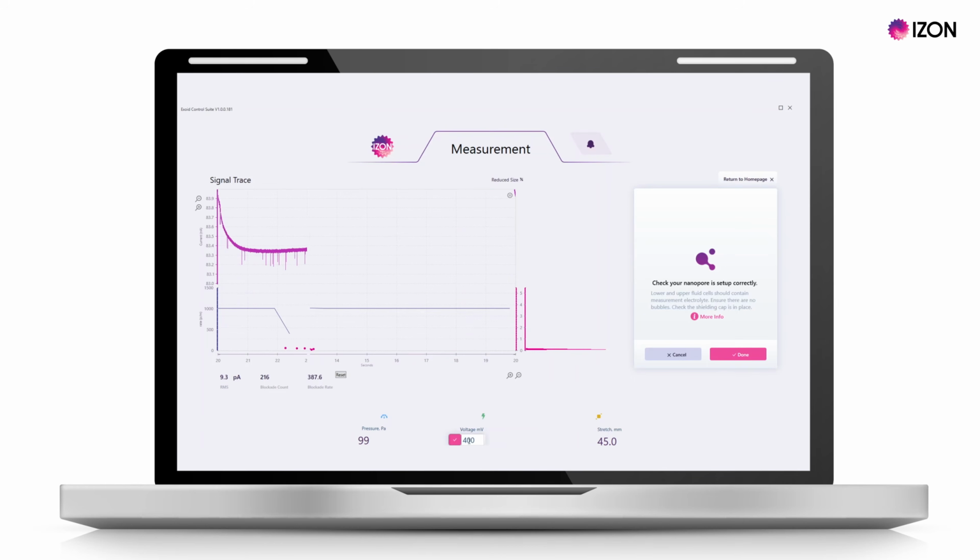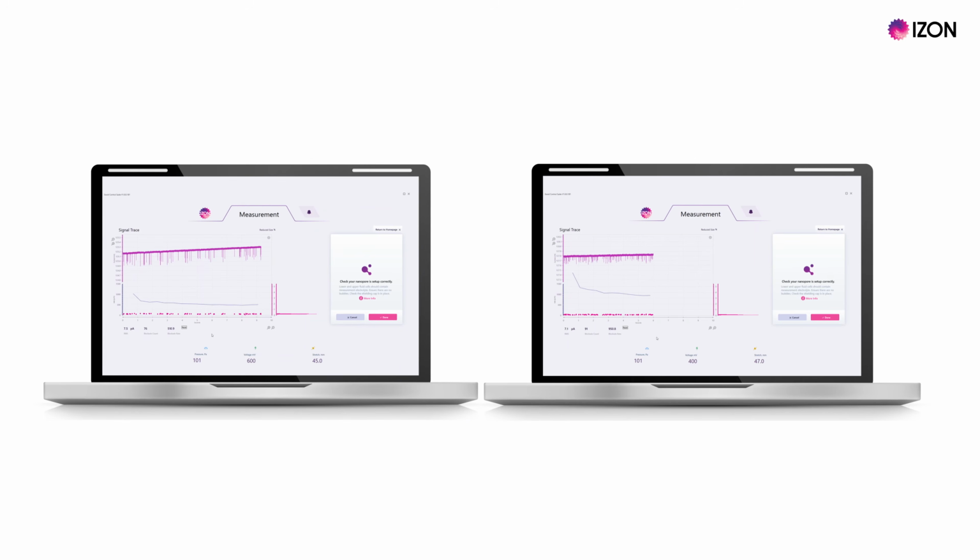To return to the previous baseline of approximately 127 nanoamps, we must now increase the voltage to achieve the same level of current through the reduced size of the aperture. By increasing the voltage to 600 millivolts, we return the baseline to 125 nanoamps. Because blockades are a measure of the volume of electrolyte displaced relative to the total amount of electrolyte in the nanopore, and the total volume of electrolyte in the nanopore has now decreased while the sample particles are the same size, you can see the blockades that were about 0.1 nanoamps in size are now closer to 0.2 nanoamps on average, reducing the likelihood of losing particles in the noise.